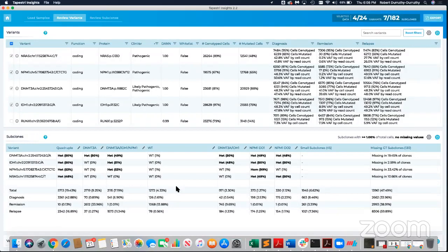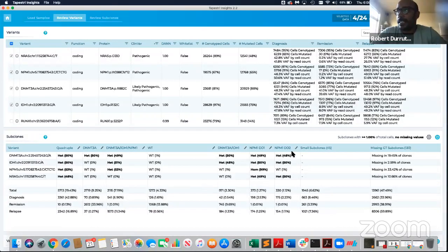Yeah, no, it's a really good explanation. So an ADO has to be wild type or homozygous, but not het. Correct. Everything that's small and that has het may be the result of potential multiplets, but those are even rarer and less likely to be above that 1% threshold.